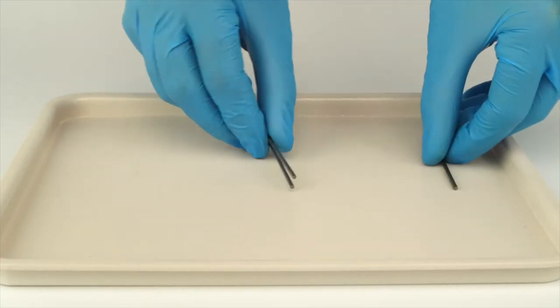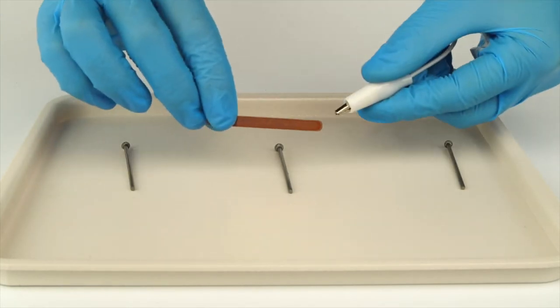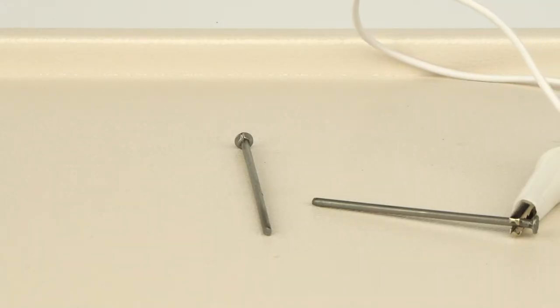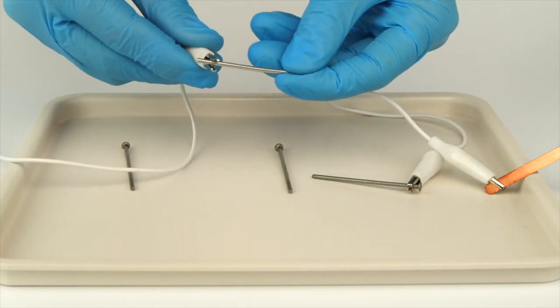Take the three iron nails. Use the crocodile clip wires to connect the first nail to the copper plate. Leave the second nail as is. Connect the third nail to the zinc wire.